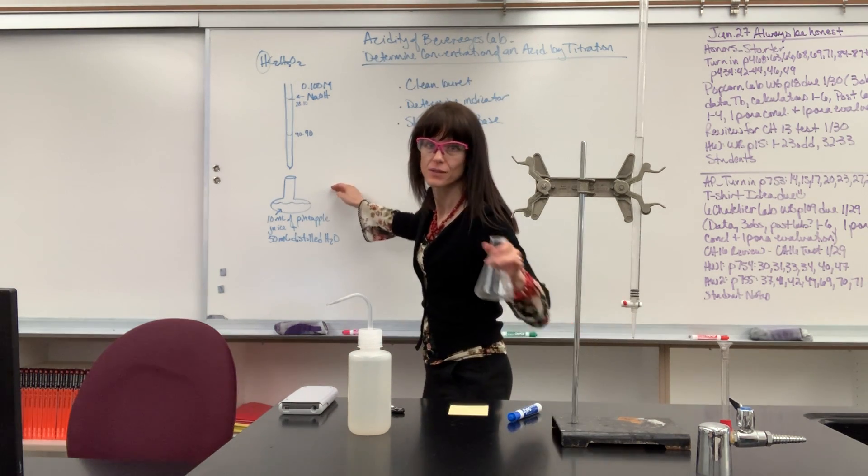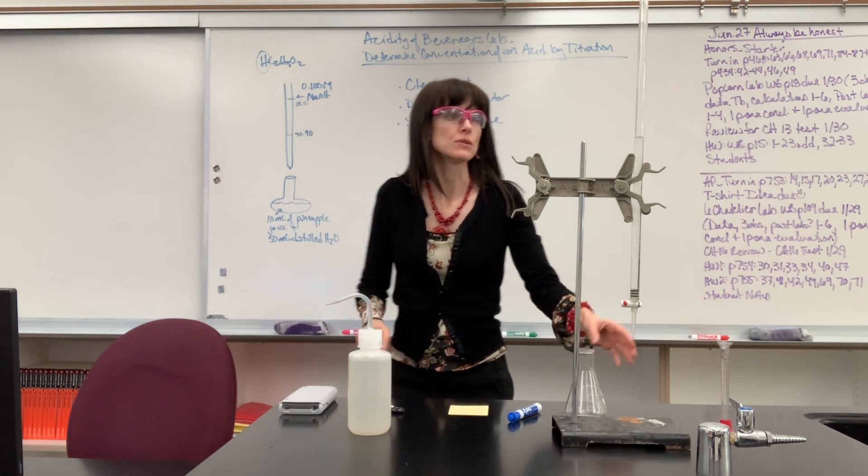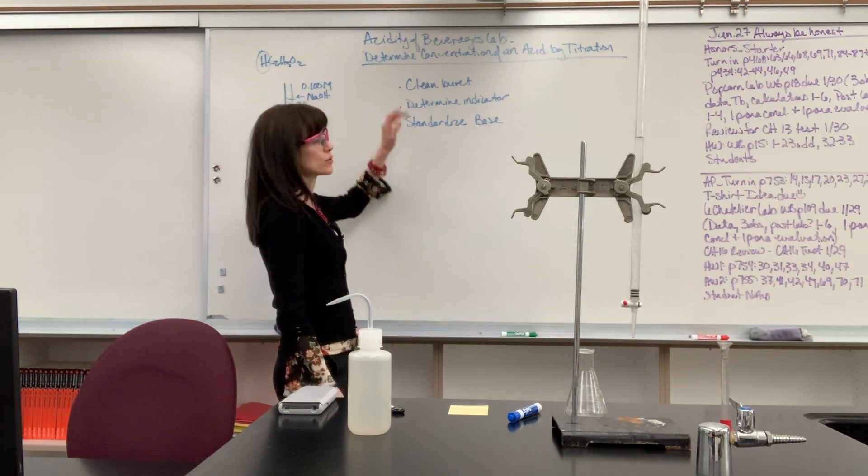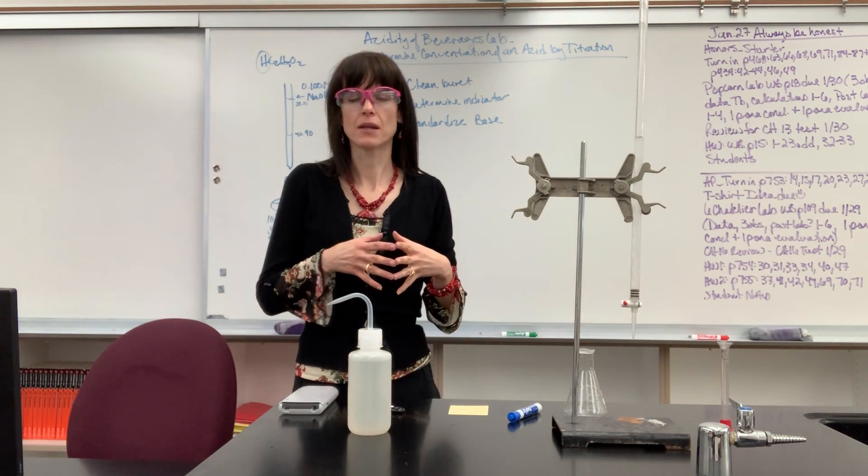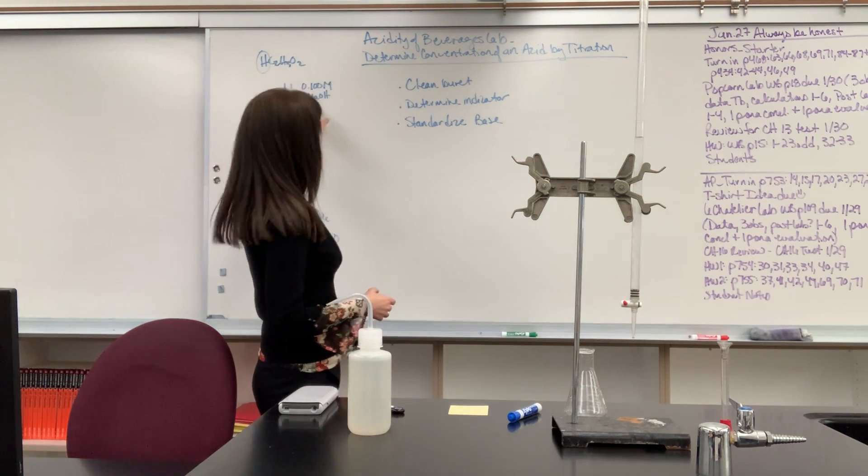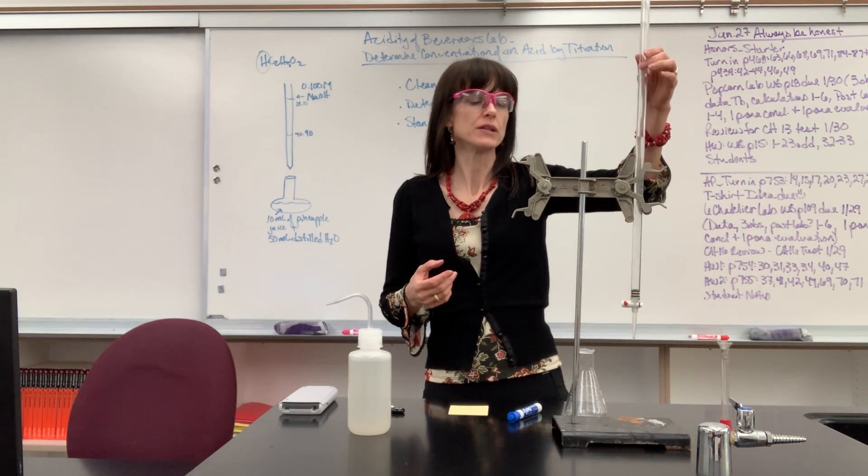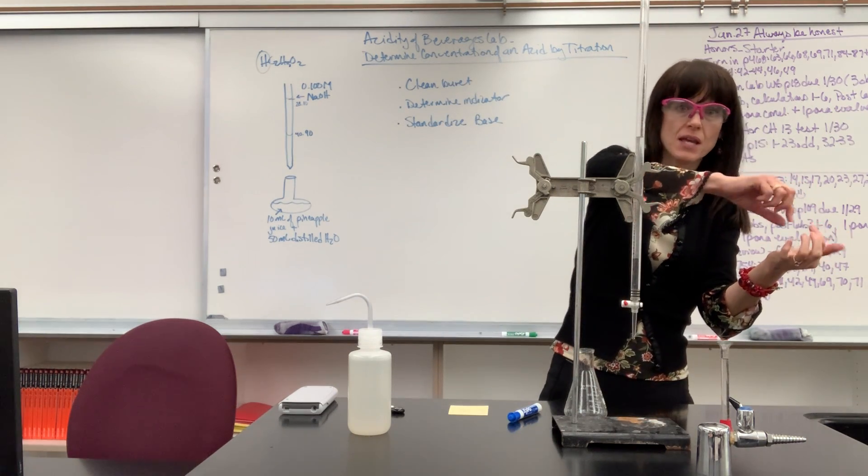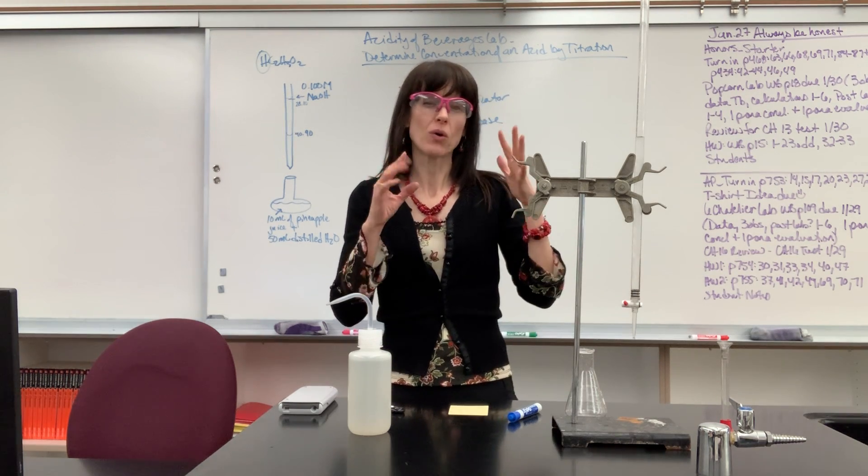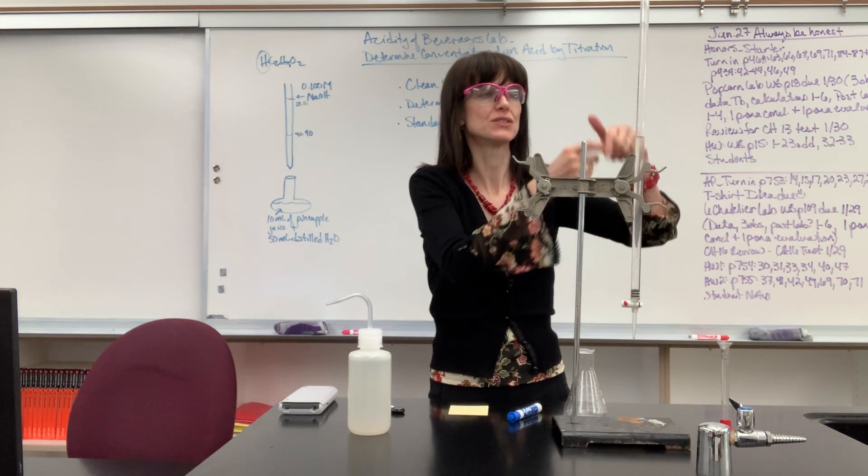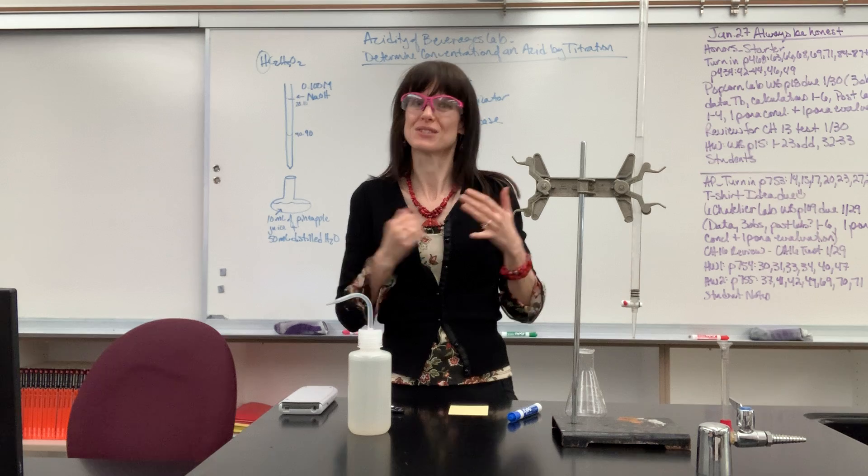Let me show you the setup. We're going to have an Erlenmeyer flask with a burette. First thing that you want to do is clean your burette. You'll clean it with hot soapy water, rinse it really good with distilled water, and then you'll take five to ten mils of your base, the sodium hydroxide. It's called washing it. You'll pour it into the burette, swirl the burette like this and pour out the sodium hydroxide into a waste container. The goal is for the sodium hydroxide to touch every bit of surface area inside that burette so the only thing inside of there is sodium hydroxide.